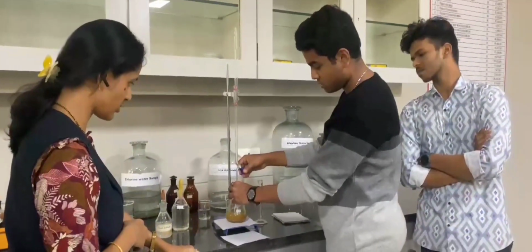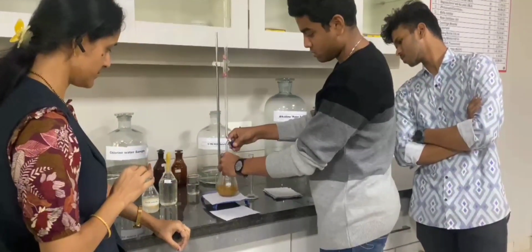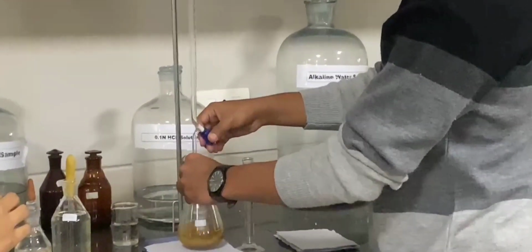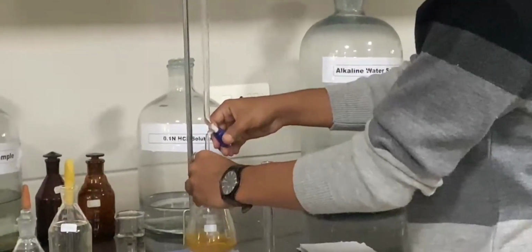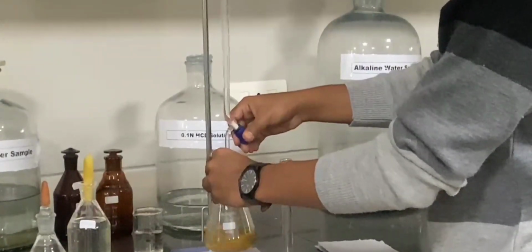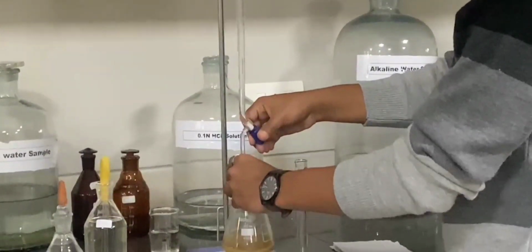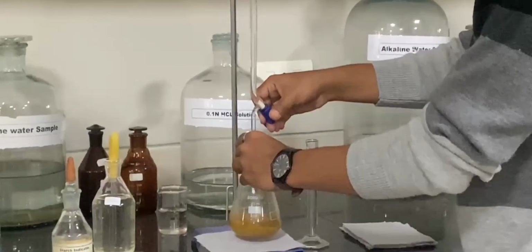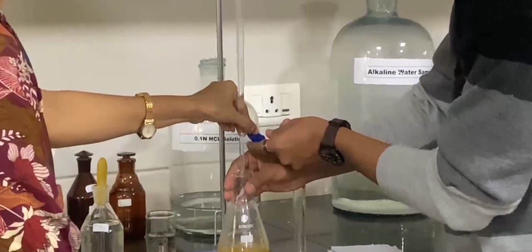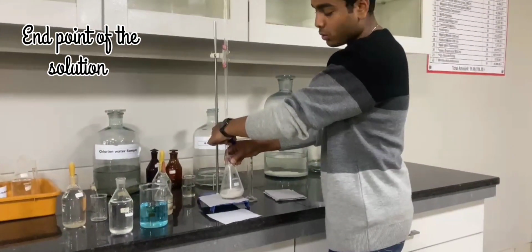You have to do the addition drop by drop, until the end point of the reaction.